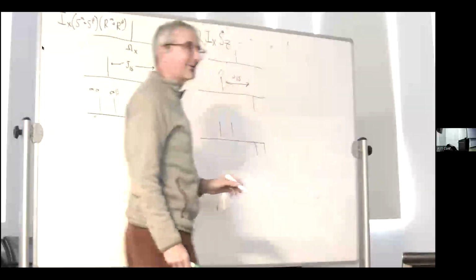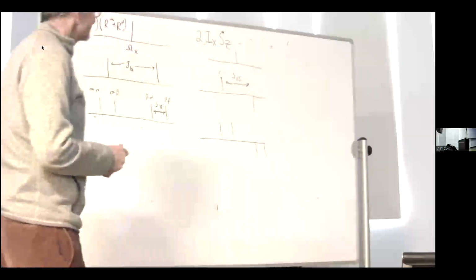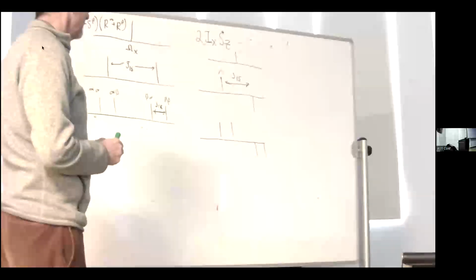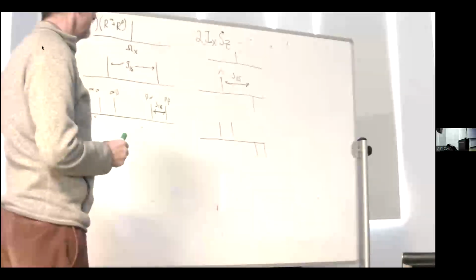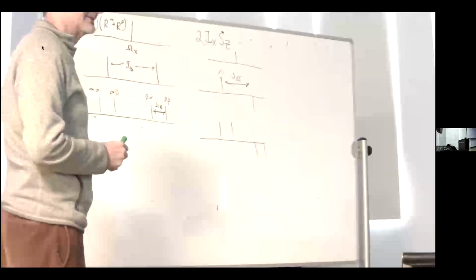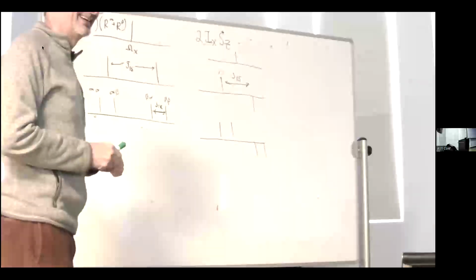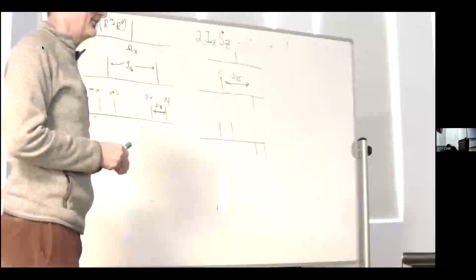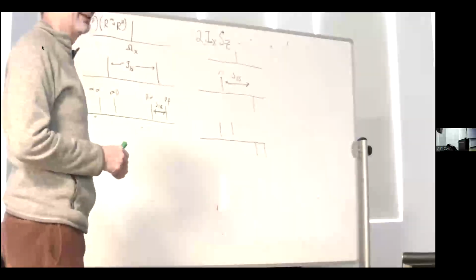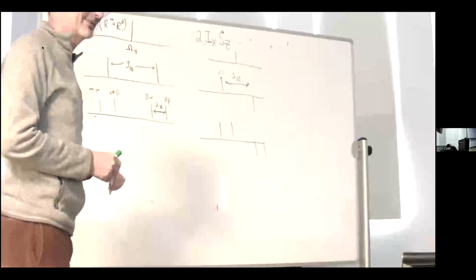And I get a pattern like that. What would happen if the two couplings were identical? Then the middle one gets canceled. And that can come up and confuse you because you think you have one doublet, and instead you have this antiphase doublet of doublets.